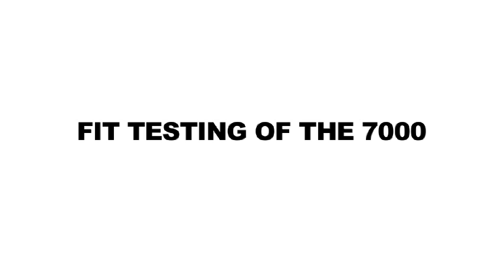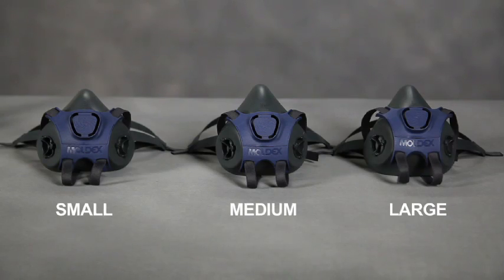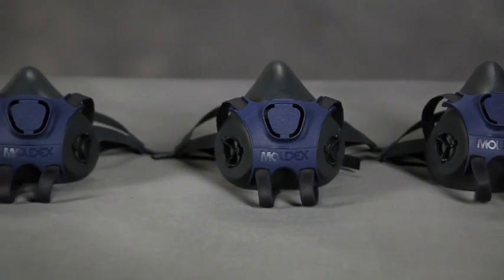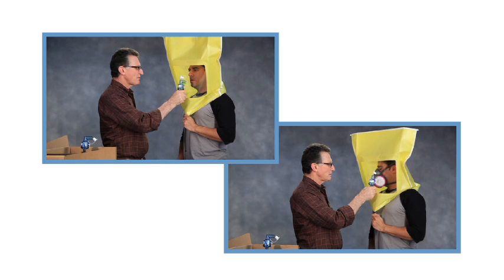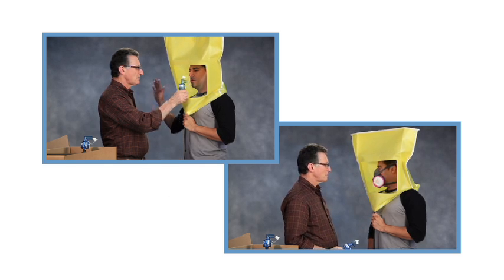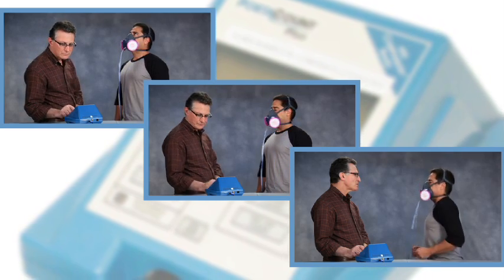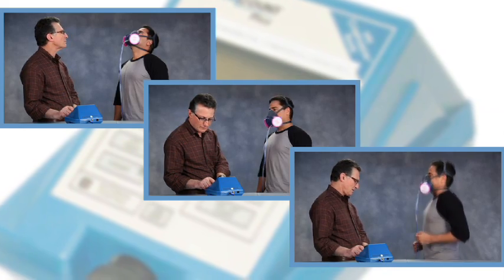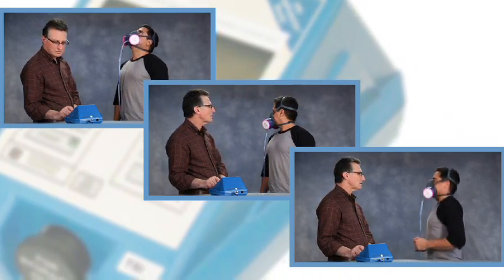You must be fit tested before using the 7000 series respirator and at least annually thereafter, using an approved fit testing method. For qualitative fit testing, use Moldex's Bittrex Qualitative Fit Test Kit. For quantitative fit testing, use TSI's PortaCount or an equivalent device together with a Moldex probed cartridge.